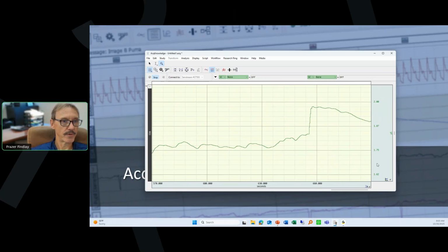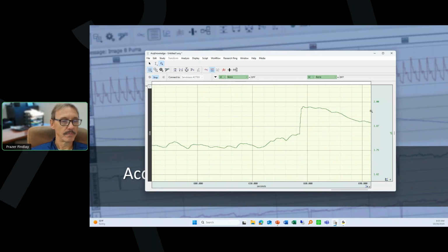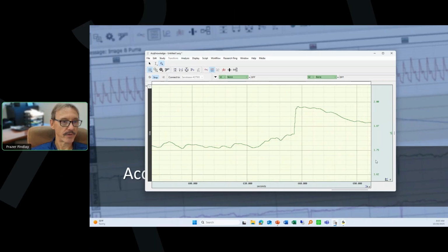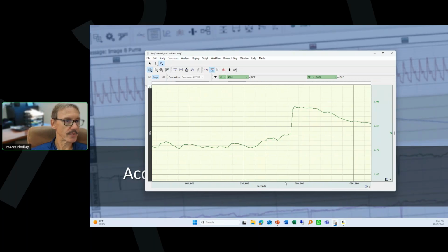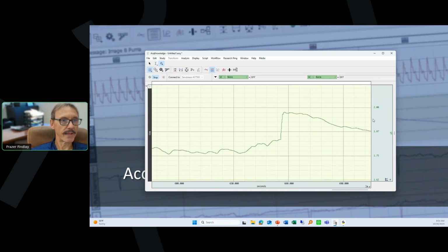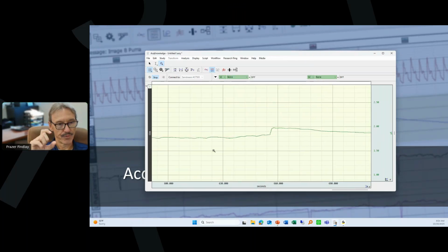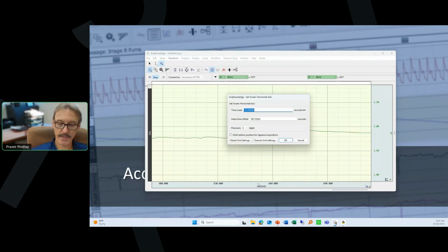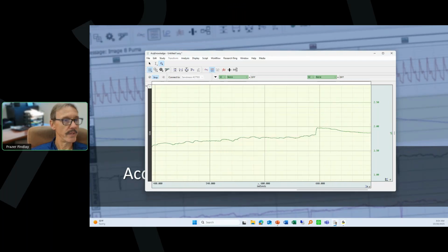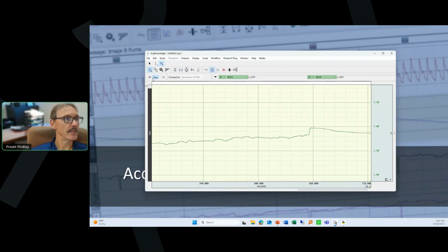Here on the right, you've got your vertical scale. This is pre-scaled when you set the ring up. So microsiemens, and then time along the bottom. With a right mouse click, you can auto scale, or you can manually make adjustments to your scaling here. So we can compress this down. In terms of the time axis on the bottom, we can make this 1 minute per division so that you see a longer period of time. Anyway, that gives you a quick example of AcqKnowledge and the ring.